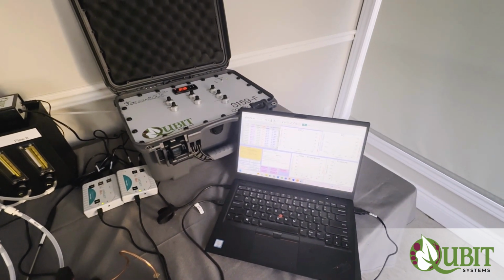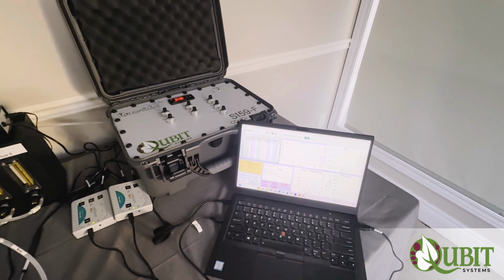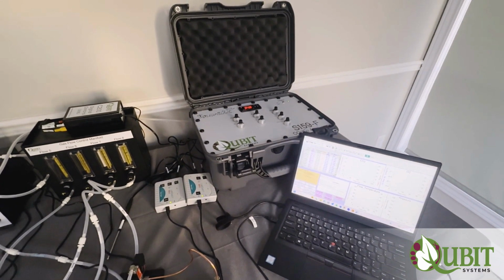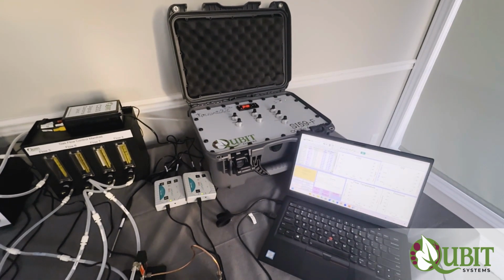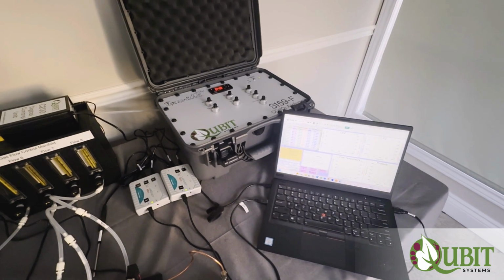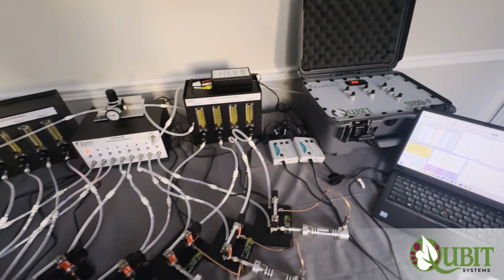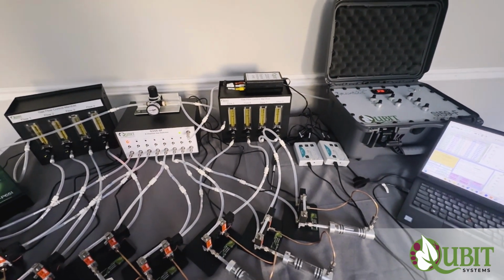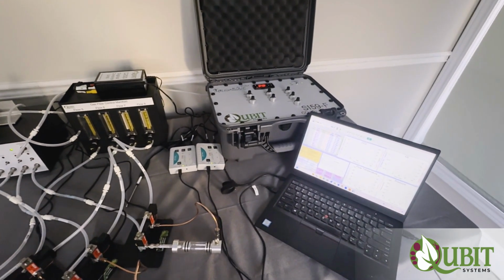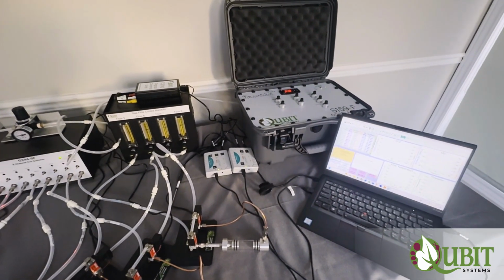When doing experiments that run over a few hours, we recommend that you save every hour or so. When running experiments that go over a few days, we really recommend that you restart your experiment every day. So have a fresh file started for each day's data, and save it, to make sure that you're not creating one very big file that may slow down the system, depending how fast your computer is. Saving is very important because Logger Pro does not automatically save, so you have to do it manually by going to File, Save As.